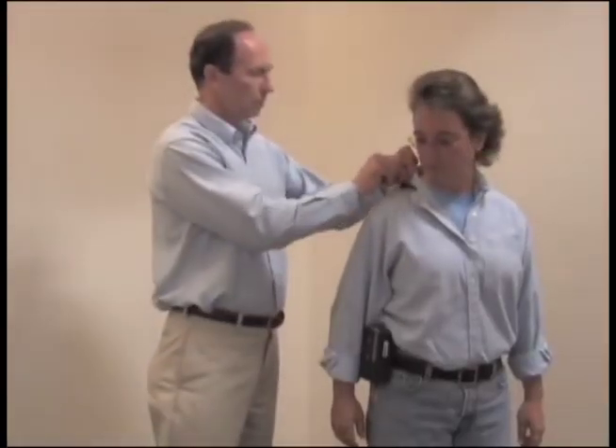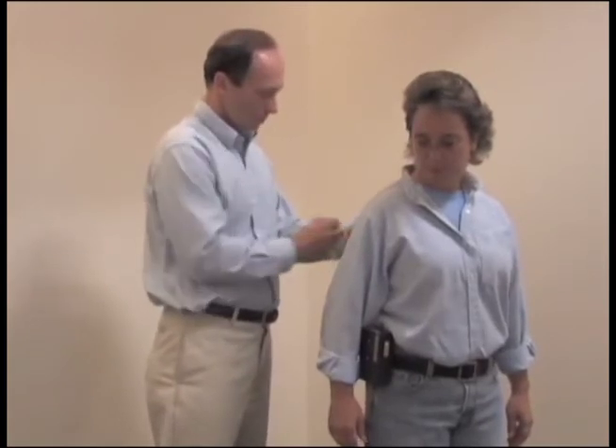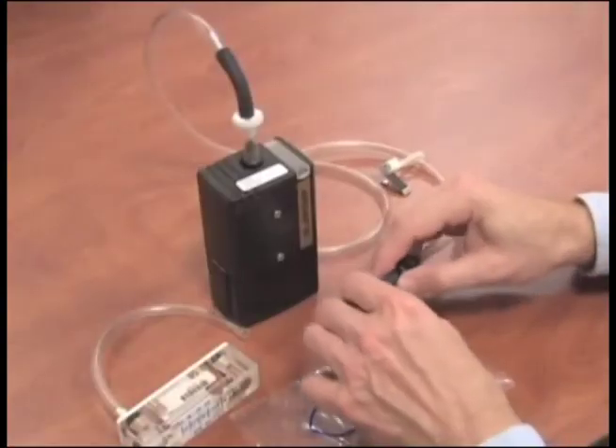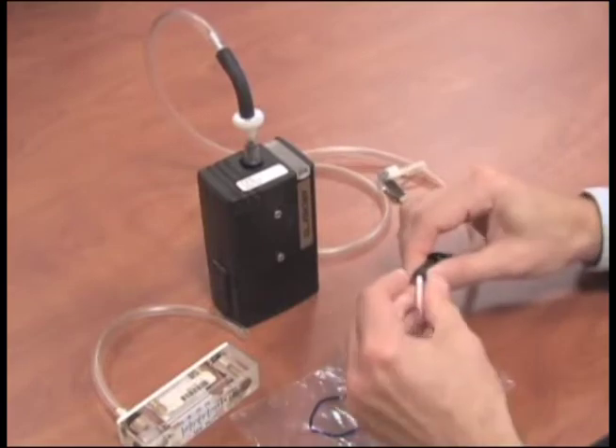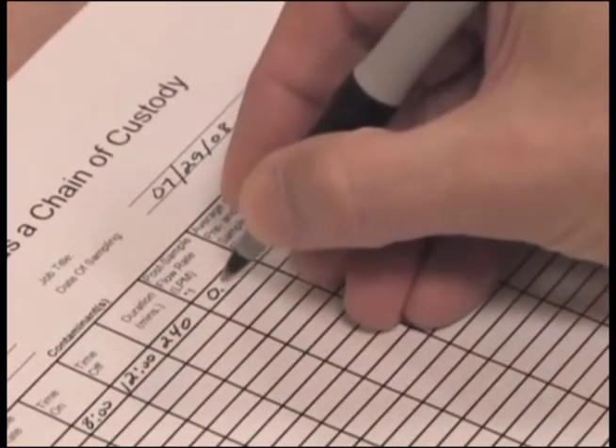Remove the equipment and return to the area where you performed the pre-calibration to perform post-calibration and prepare your sample for shipment. Perform a post-calibration following the same process used for pre-calibration, then record the flow rate on the pump calibration sheet.